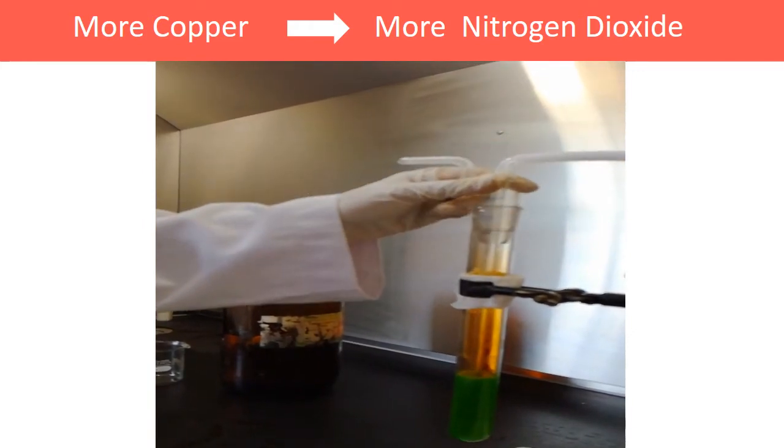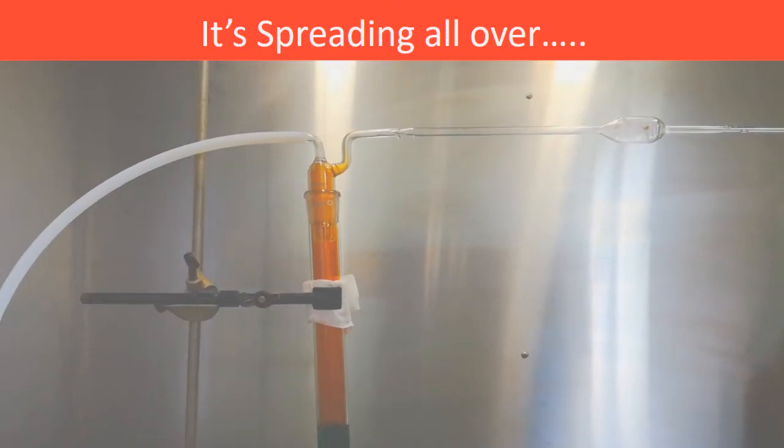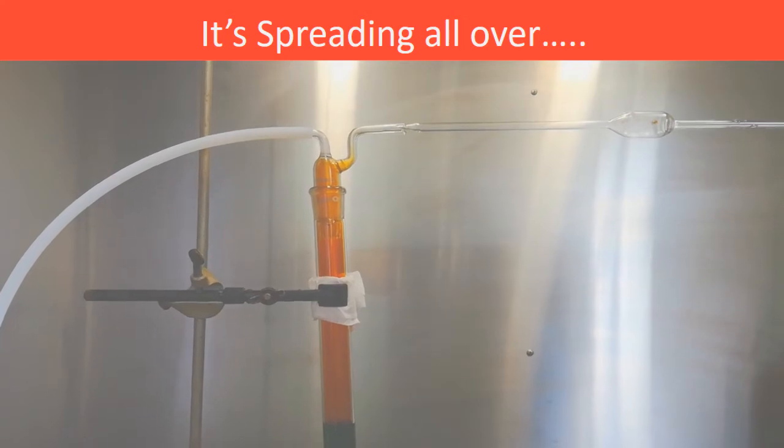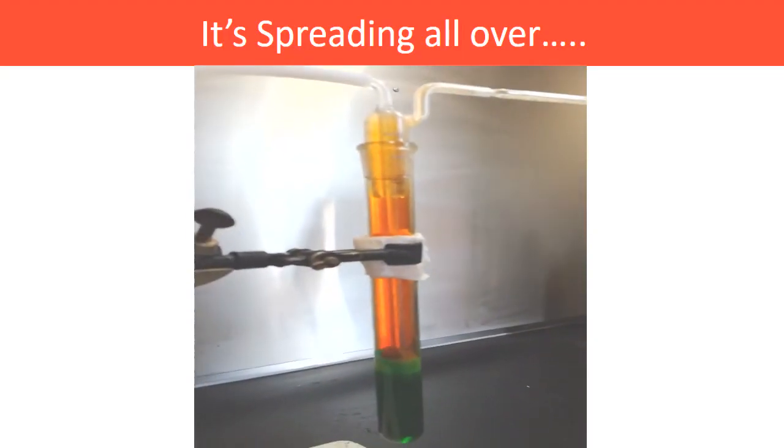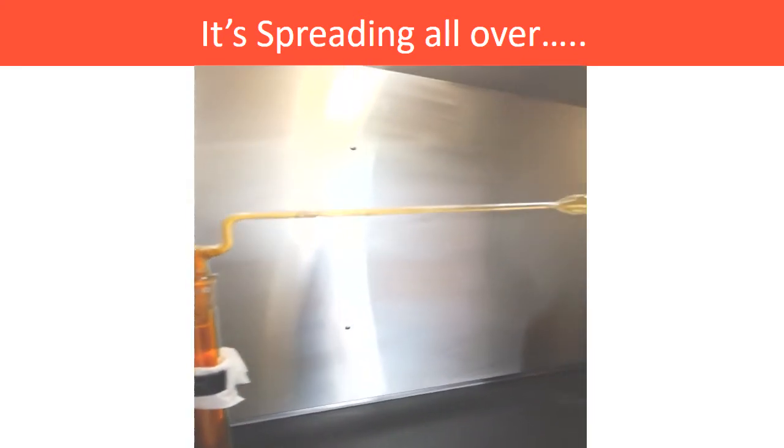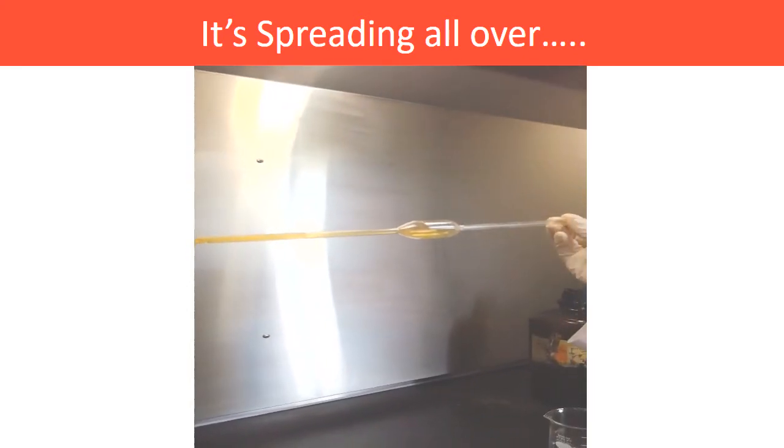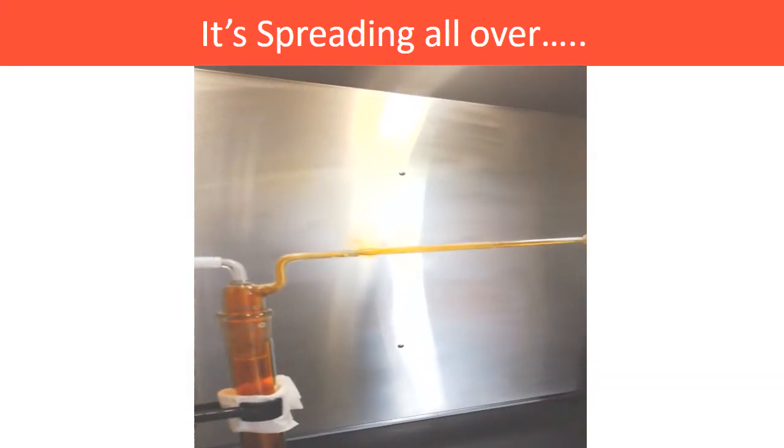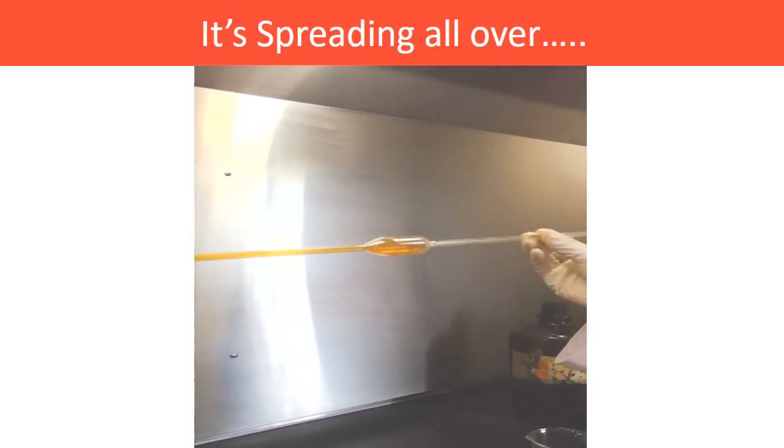Here we add some more copper pieces into the test tube in order to observe a faster mass transfer. Therefore, the gas is moving faster than before. We can observe that the nitrogen dioxide gas is moving throughout the entire test tube and it's spreading all over.